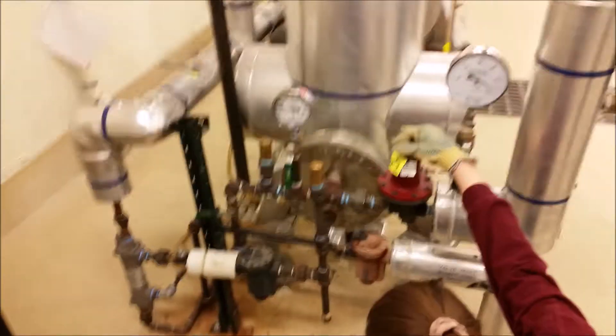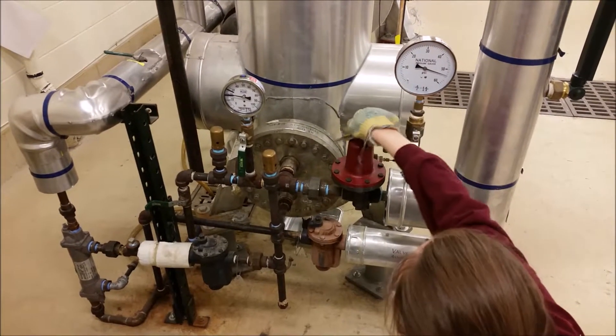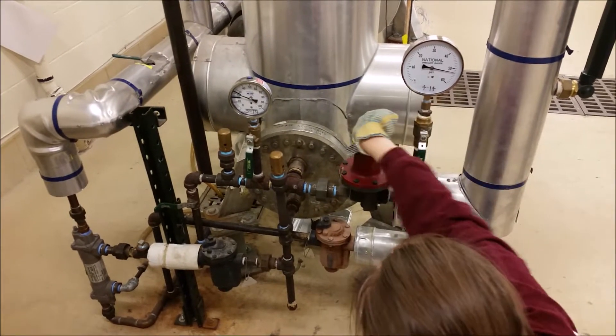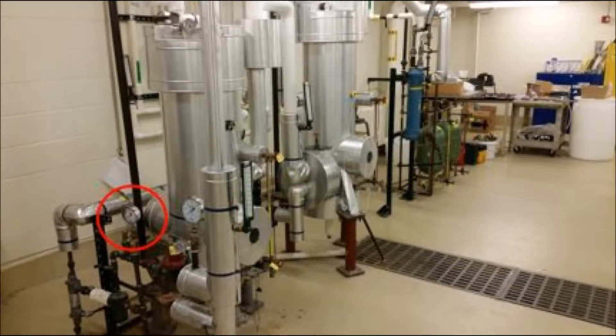Do not exceed 60 psig. Now open V2, the red Jordan valve, to your desired pressure between 15 and 30. To increase your pressure, turn clockwise; to decrease, turn counterclockwise. You will need to adjust V1 so the pressure reads 55 psig every time you adjust V2. Allow your system to reach steady state and perform any experimentation.